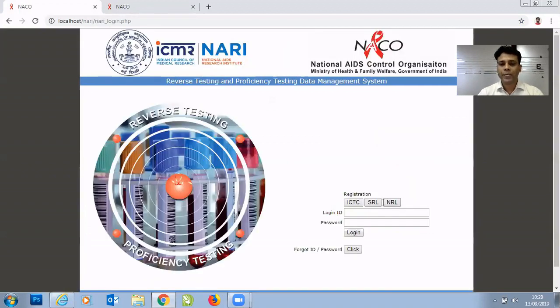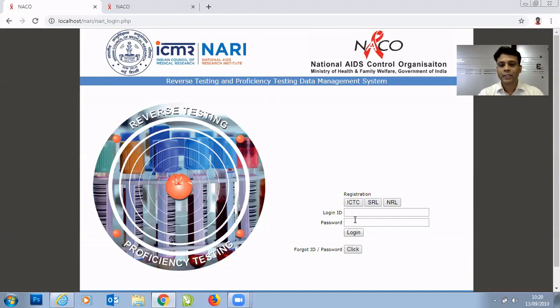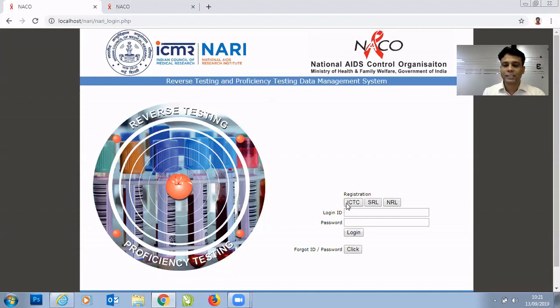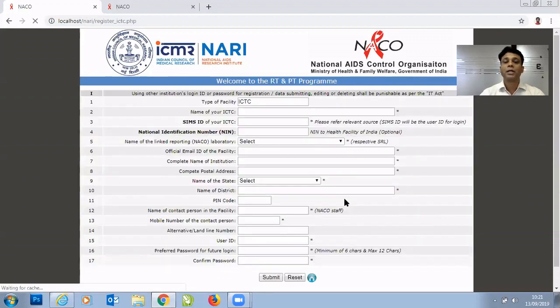Once you click on the tool for PT and RT, another page specific to reverse testing and proficiency testing data management will open. To access this tool, you will require a login ID and a password. This login ID and password is obtained by registering your facility. The facility can be an ICTC, SRL, NRL, or Apex Laboratory — all of these are involved in reverse testing and proficiency testing and everybody needs to register in this portal. If you are an ICTC, click on the ICTC tab, which will open a registration page.